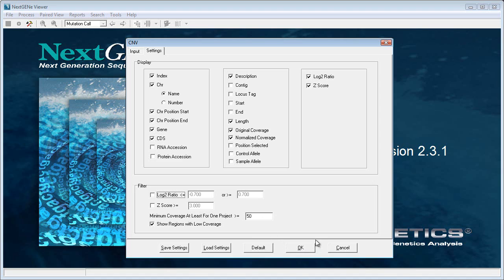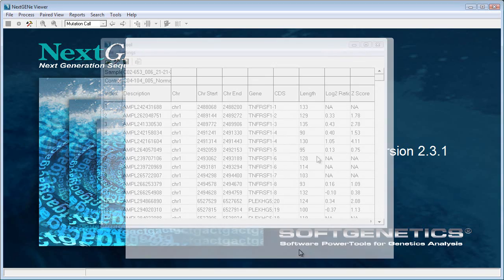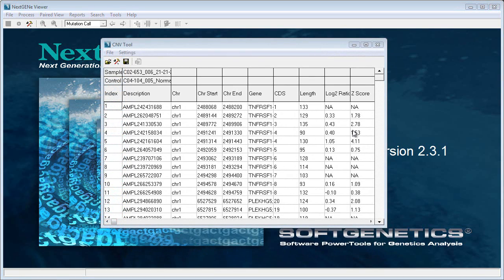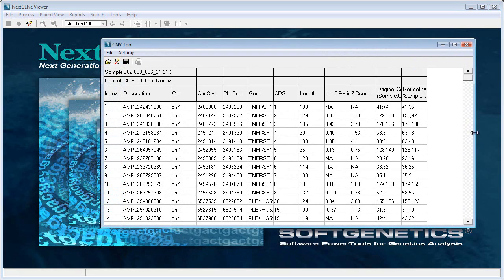So that's what I'll do — I'll generate one of these comparisons for each sample and save the report. Generating the report, in this case, took about 60 seconds.